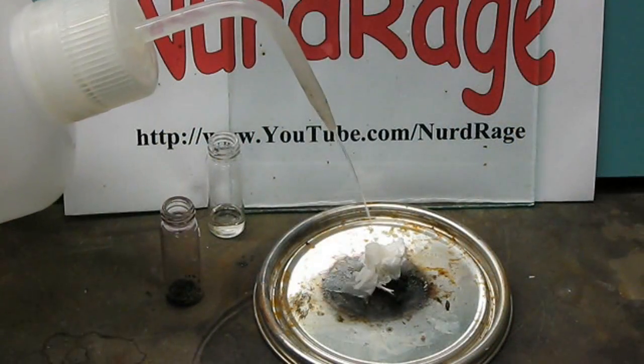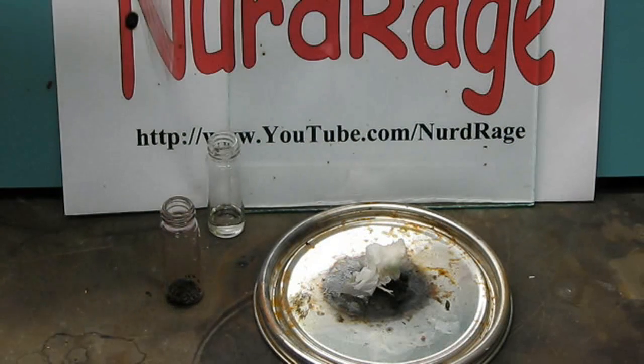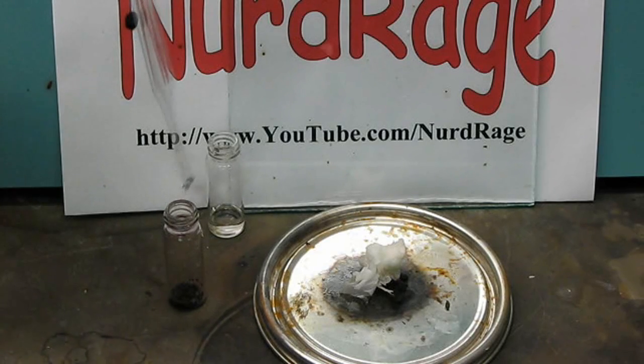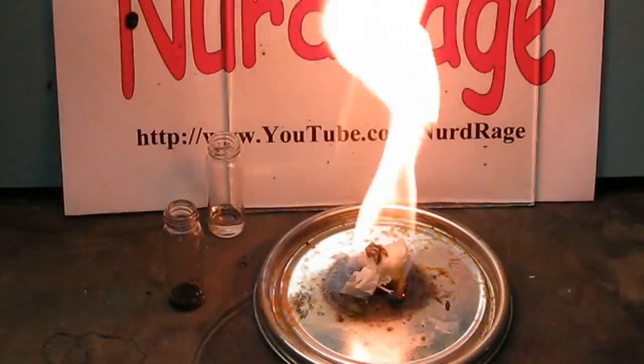Third, a piece of tissue is soaked in acetone to make it more flammable. Then a drop of sulfuric acid is drawn into a pipette, and the pipette is dipped in potassium permanganate to pick up some crystals. Then the sulfuric acid is squeezed out, causing it to mix with the potassium permanganate and form manganese heptoxide that instantly sets the tissue on fire.